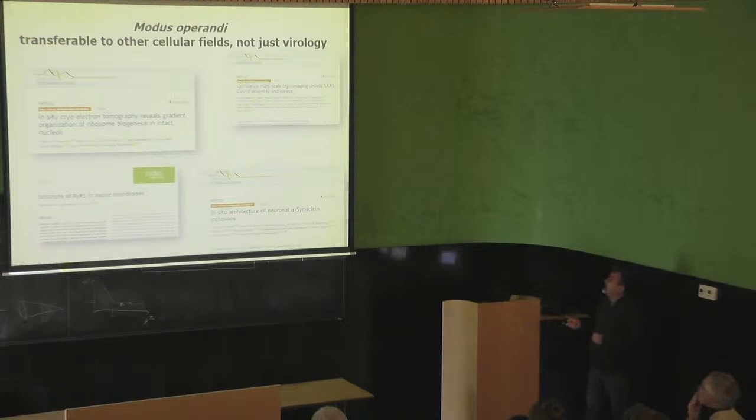And I think it is a great opportunity for our centers and for the Basque scientific system to have this CryoFIB monster here. There are also challenges ahead. For example, this will be the first CryoFIB with plasma to be used on cells. There is a huge expectation, and there are methodological tasks to perform, because nowadays everybody uses gallium, but we have been talking and discussing with Andrea and Eugene.